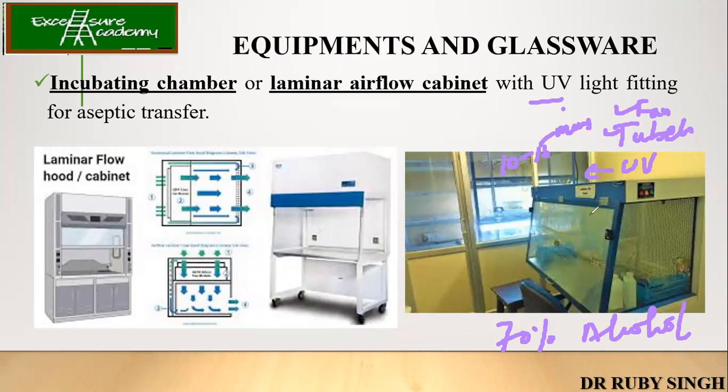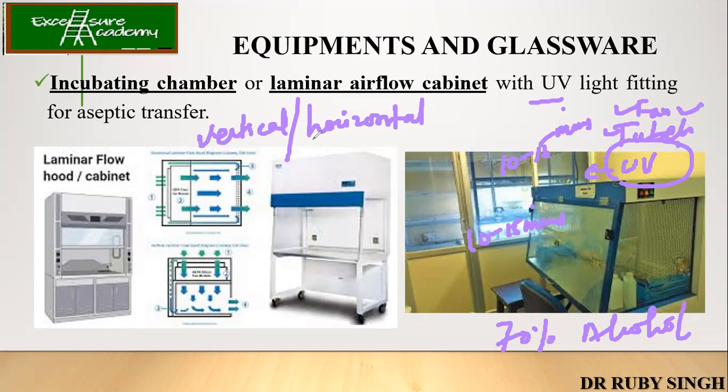Once your work is done, close the shutter, switch off your fan and tube light, and then again switch on the UV for another 10 to 15 minutes. This is the procedure by which you're going to use the laminar airflow. Now you can have laminar airflow either vertical or horizontal. What does it mean? Vertical means the air will be coming from the top. Horizontal means the air will be coming from this side towards you. Basically, we work with the horizontal only.